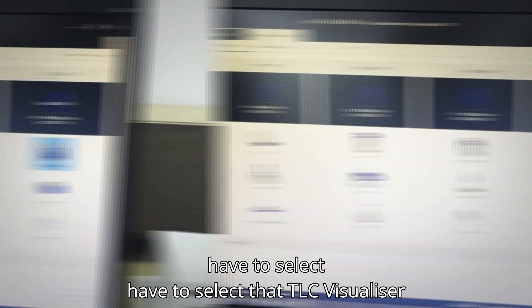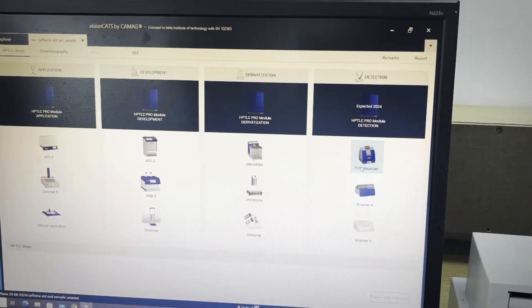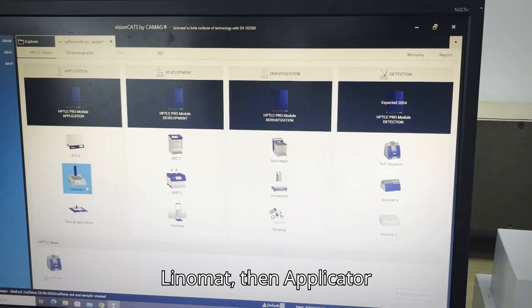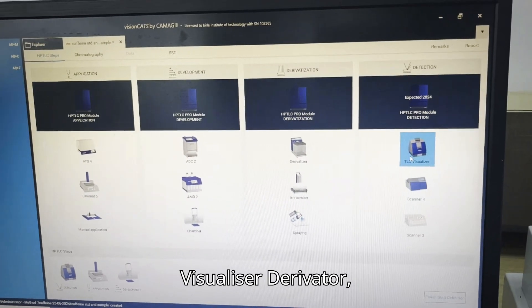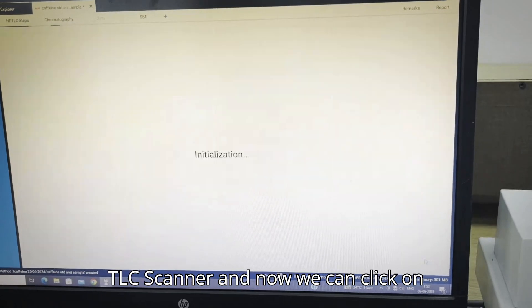First we will have to select that TLC visualizer, Linomat, then applicator, development chamber, TLC visualizer, derivatizer, TLC scanner and now we can click on finish.